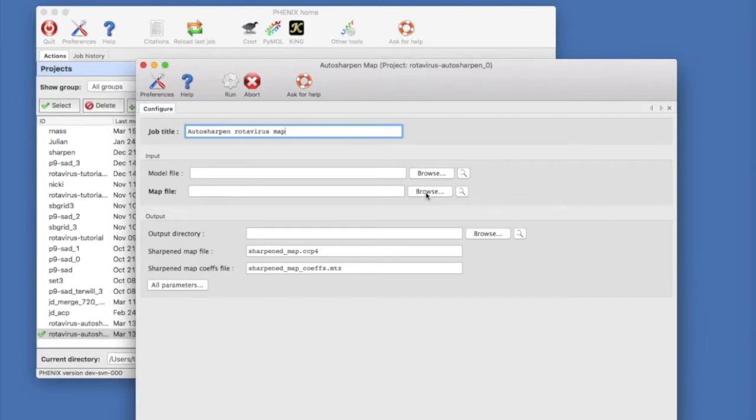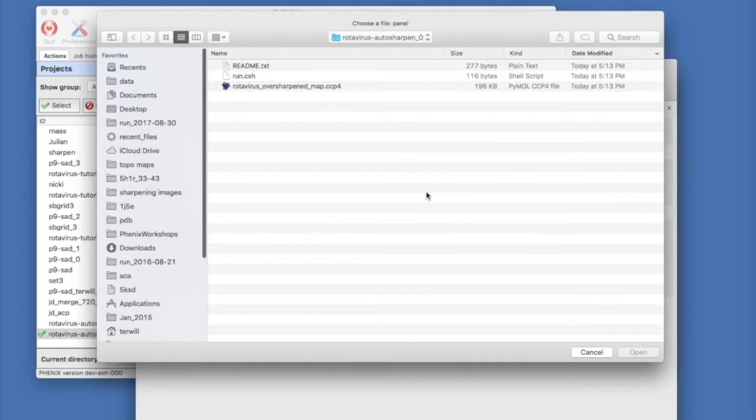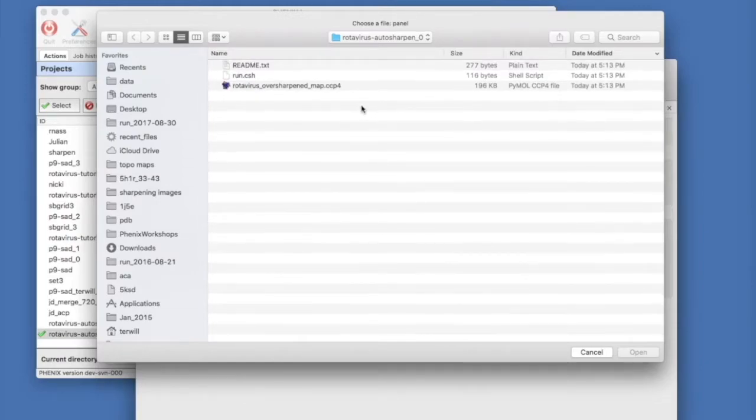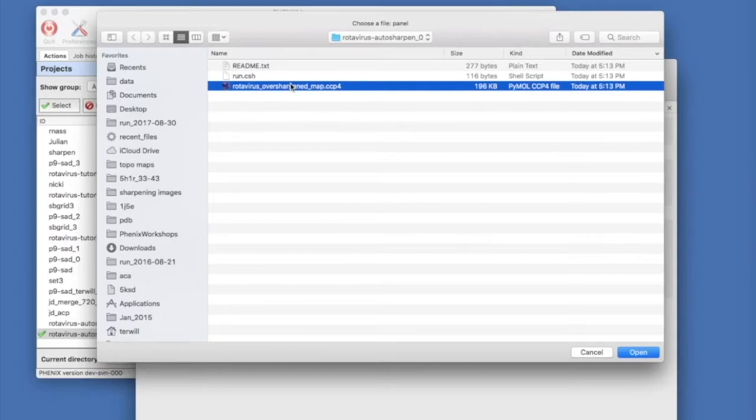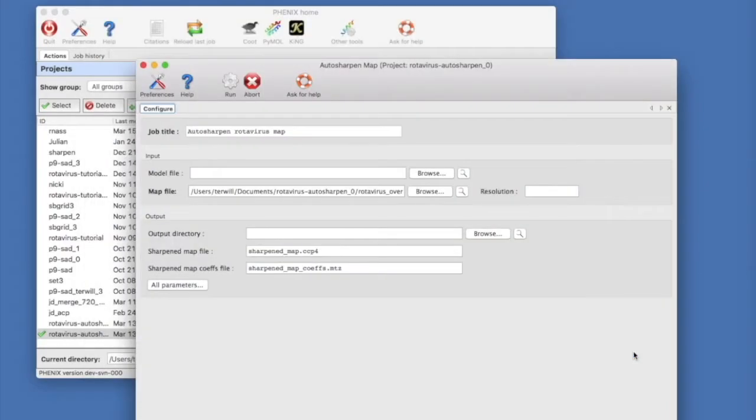We can choose our map file by clicking on Browse, which will take us to the directory where we copied the tutorial data. Select rotavirus over sharpened map and click open to load the file. Let's set the resolution to 2.6 angstroms.